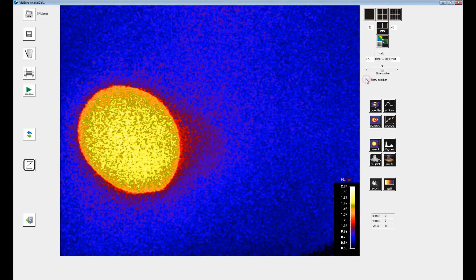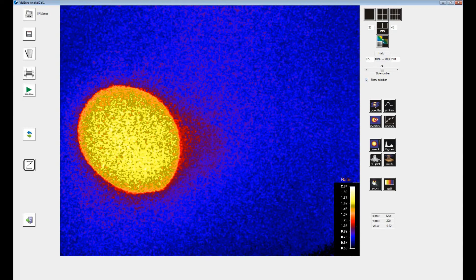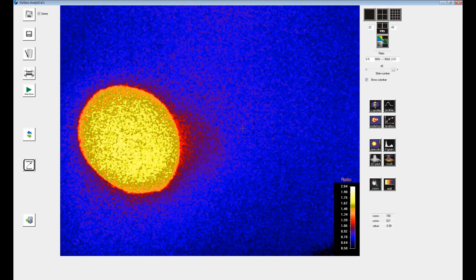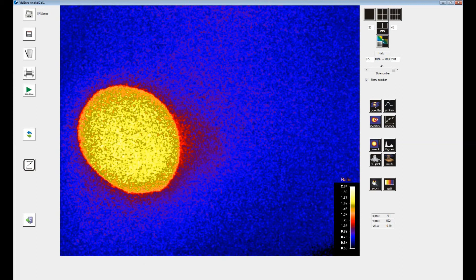Switch back to the pseudo color display. You can also display the color bar for the current image by clicking the respective box. Here the ratio is displayed.